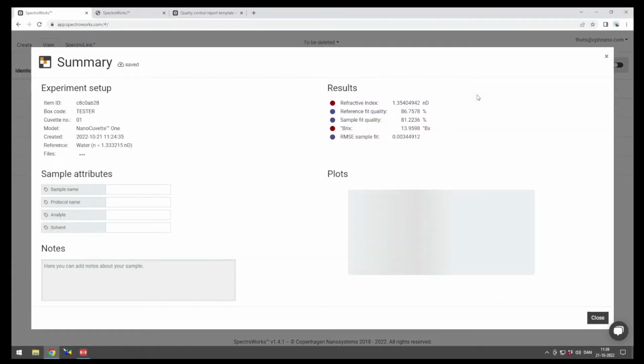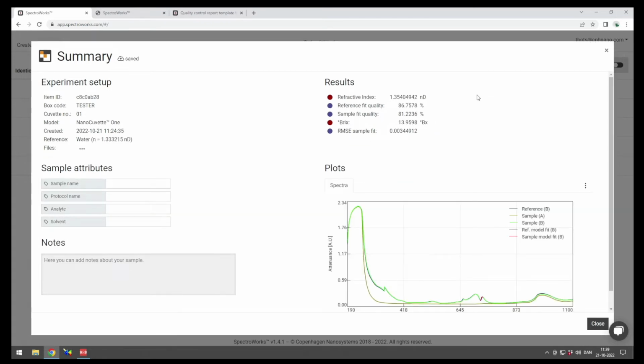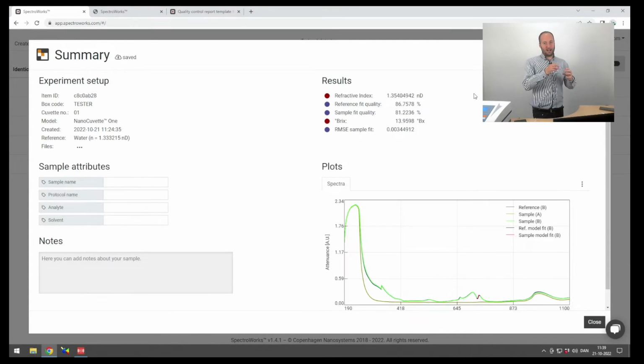And this would be a direct measure of whether it is a cluster of many small particles, or whether you have bigger particles like pigments. And you know, the very small particles, they are photoactive, whereas the bigger particles are more reflective. So it really depends on what you want to design your titanium for.